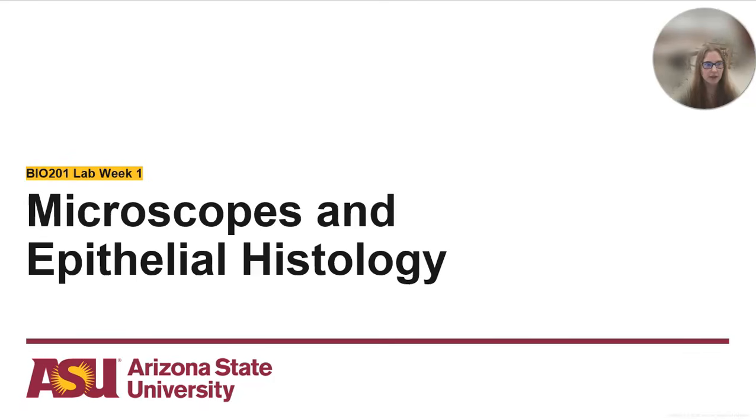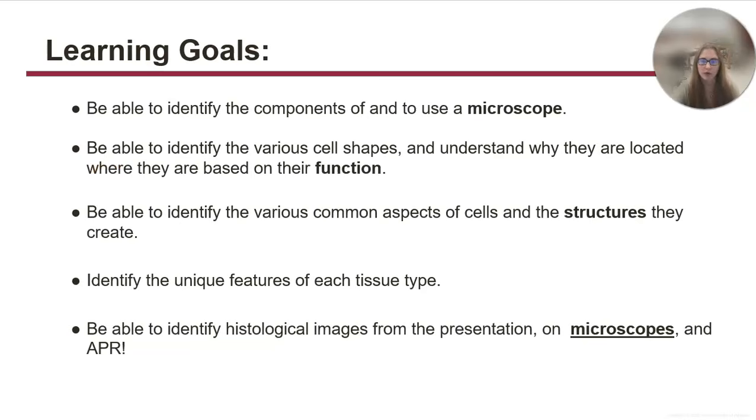So to get us started, first up, we're going to talk about what the major takeaways from these next few videos are going to be. The first thing you want to come to lab being able to do is identify the components of and use a microscope. So you want to come into lab already knowing what parts you're going to need to worry about and how you're going to be able to get a microscope slide visualized.